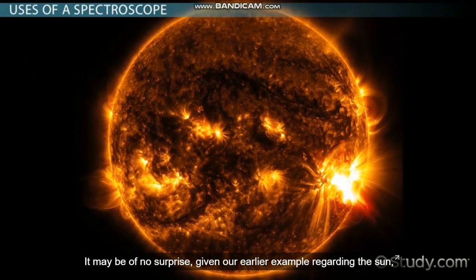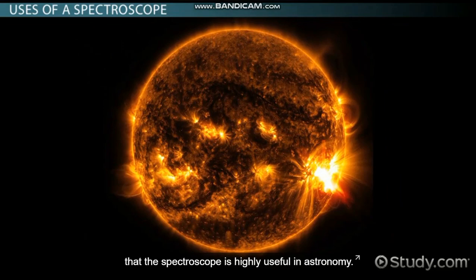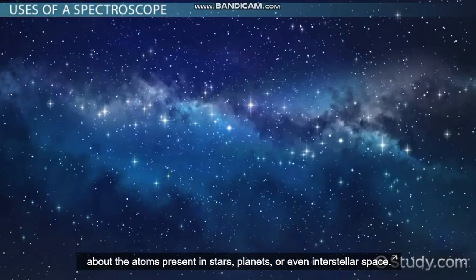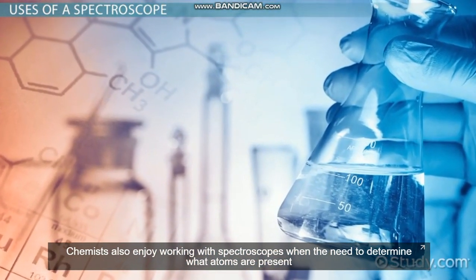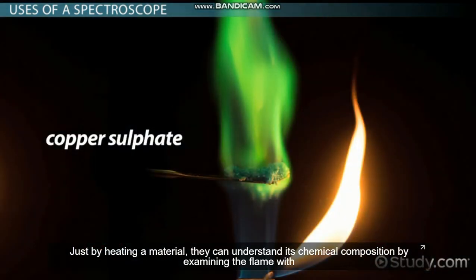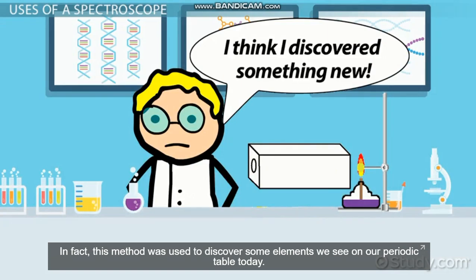It may be of no surprise, given our earlier example regarding the sun, that the spectroscope is highly useful in astronomy. You may encounter a spectroscope partnered to a telescope when the desire emerges to learn more about the atoms present in stars, planets, or even interstellar space. Chemists also enjoy working with spectroscopes when the need to determine what atoms are present in a material is required. Just by heating a material, they can understand its chemical composition by examining the flame with a spectroscope. In fact, this method was used to discover some elements we see on our periodic table today.